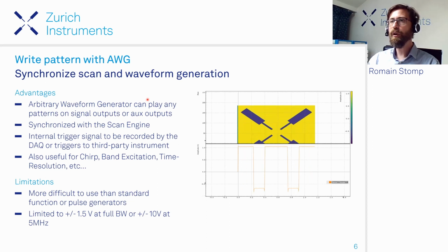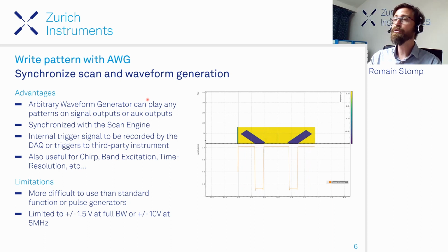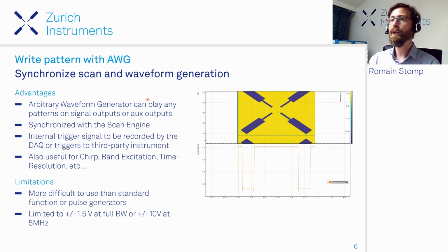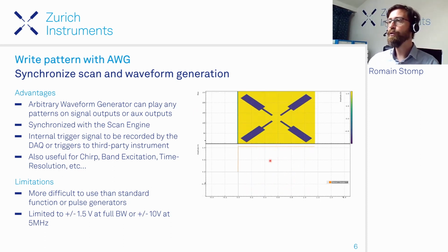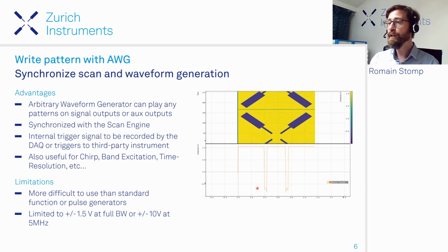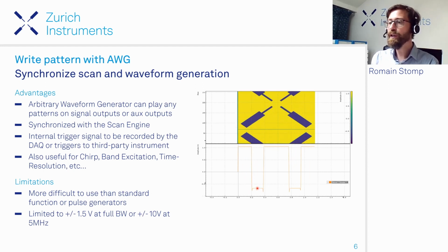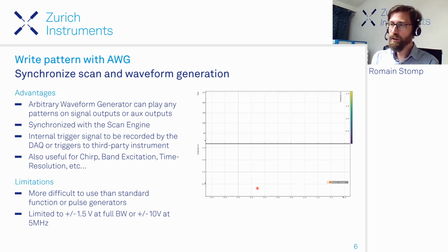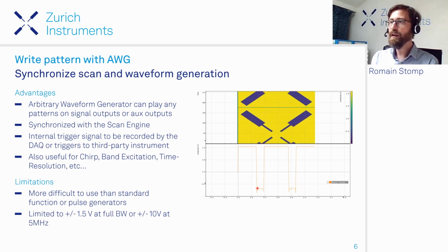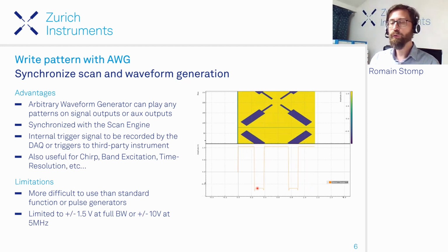Okay, so what makes a good arbitrary waveform generator, especially compared to a pulse generator? If you just look at this picture, you see that you are basically only generating pulses, but it's all about timing. An AWG is about generating on the output the right sample at the right time, and then orchestrating everything with all the equipment that you need to acquire the data.